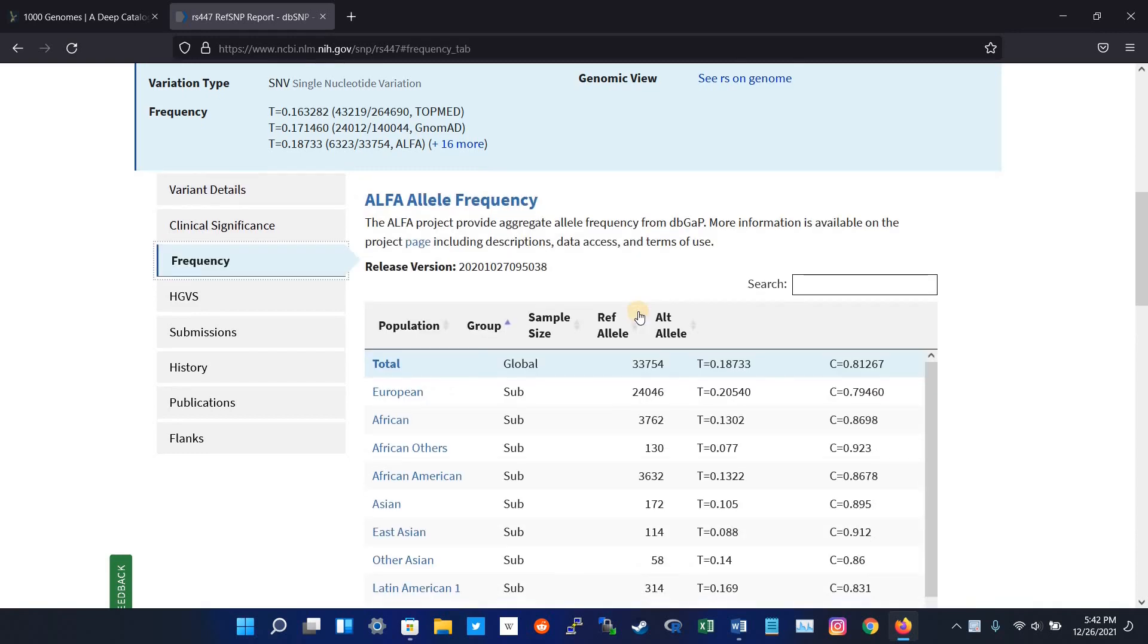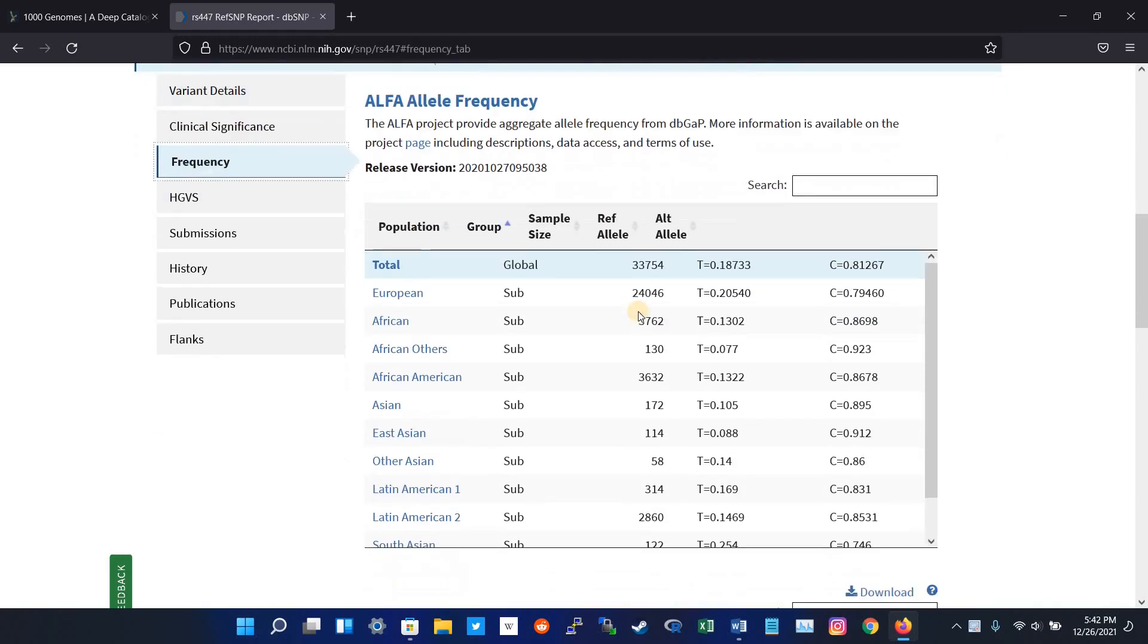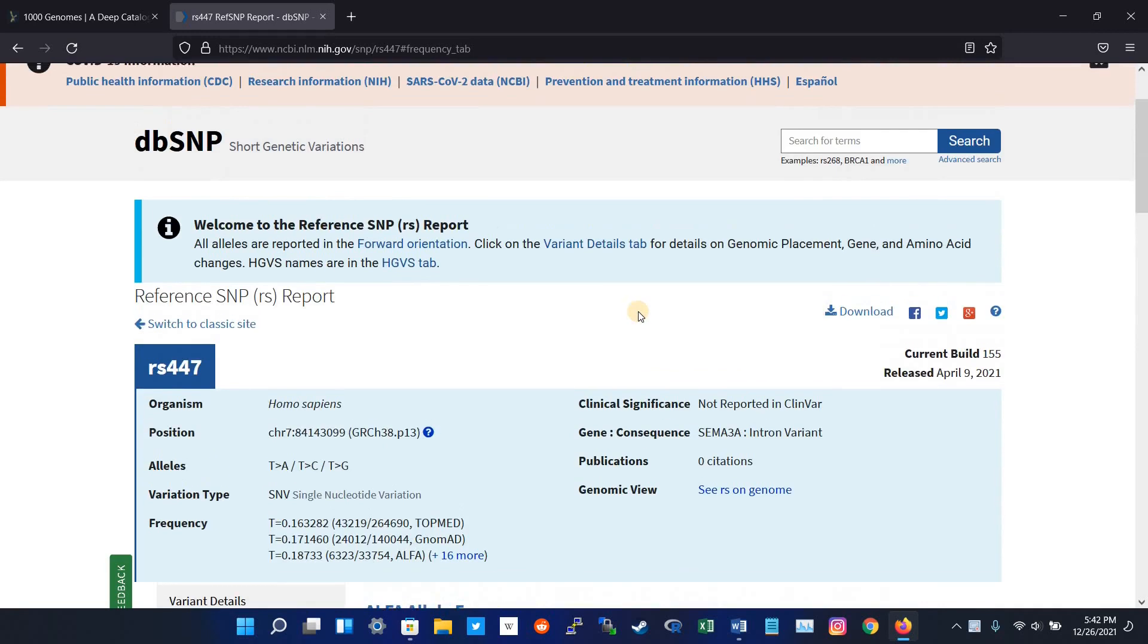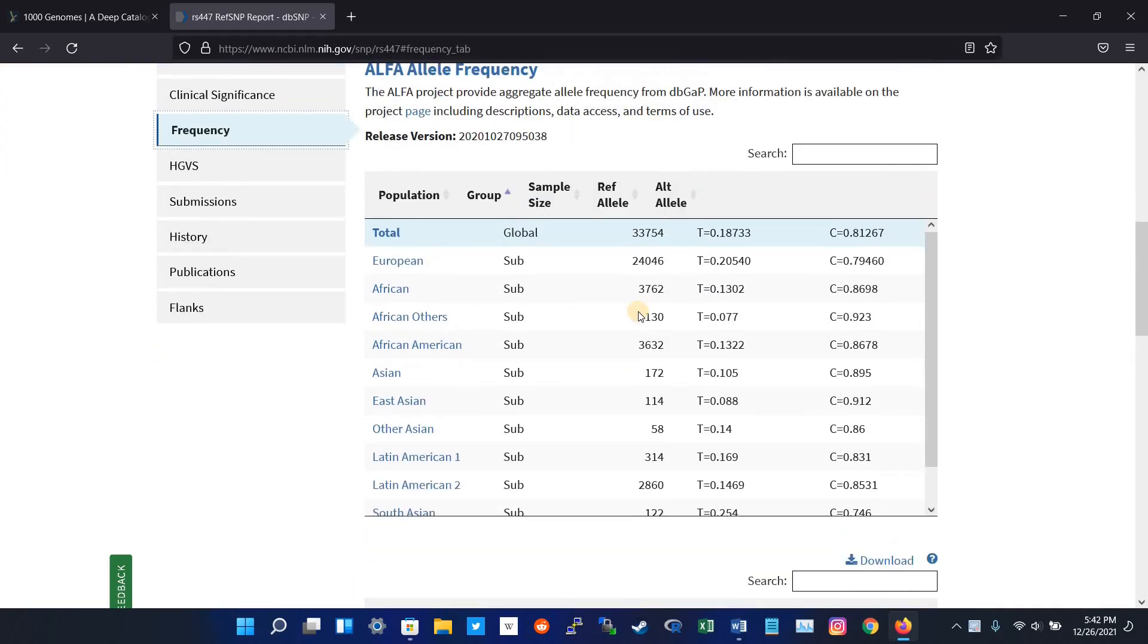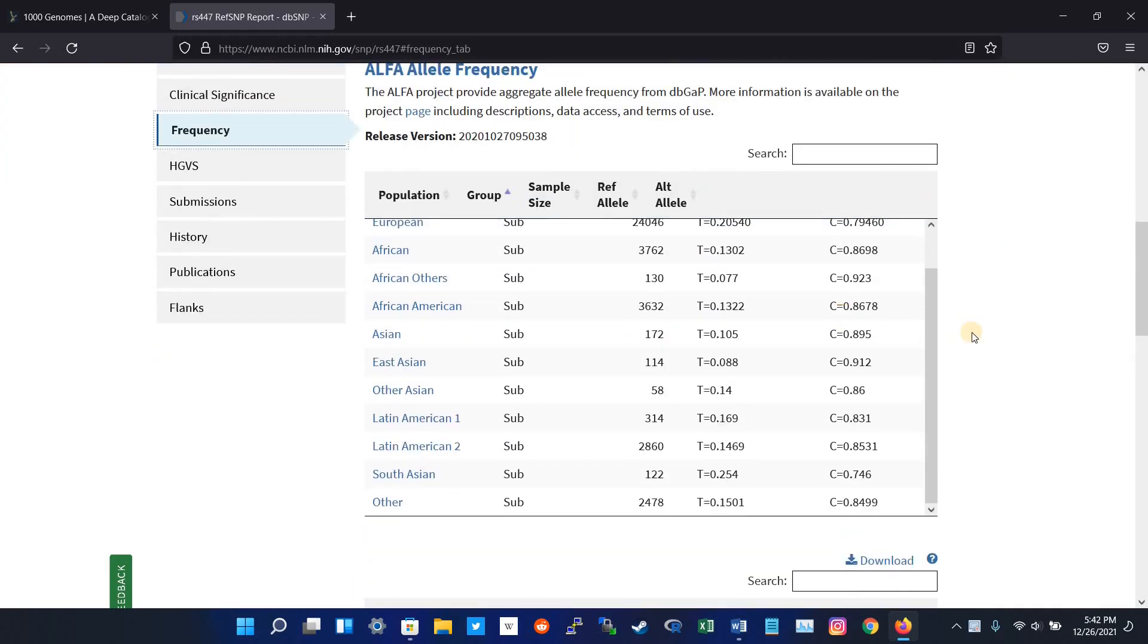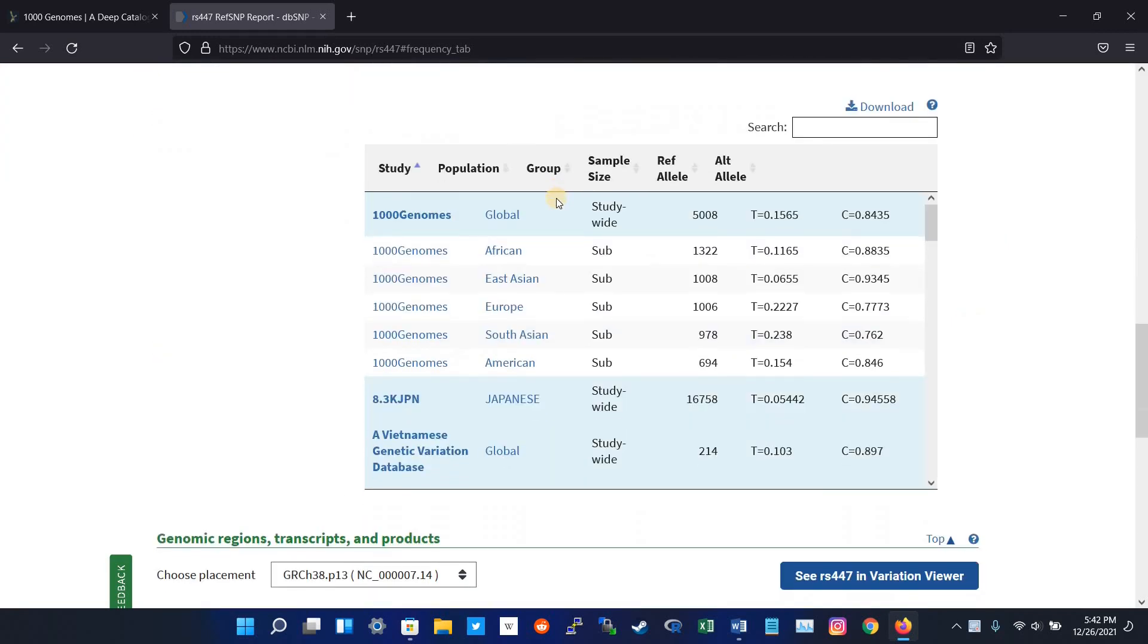It will give me the frequency of this particular SNP in different databases. And here is the frequency in Thousand Genome.